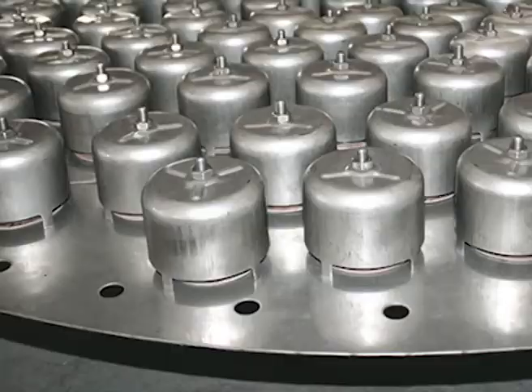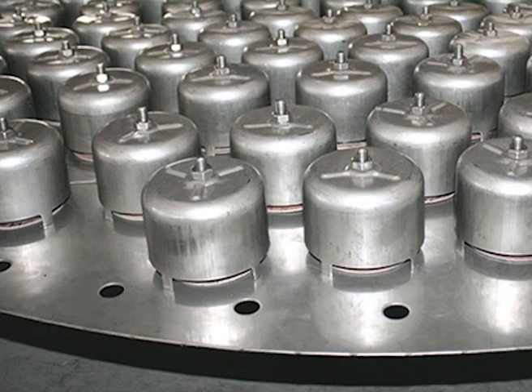A theoretical plate is an imaginary concept that does not conform to any actual parameter in the column, but for evaluation purposes it is a useful measure. Plate height refers to the length in the column between any two adjacent plates. The name is derived from the theory of distillation, in which the column is made up of a series of bubble cap trays, plates, and separation is performed in these discrete stages or plates.